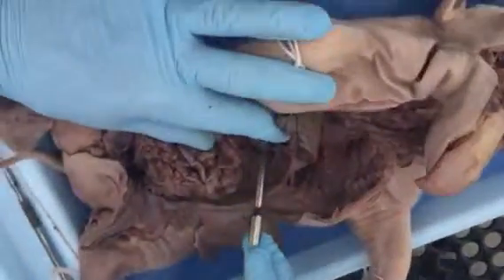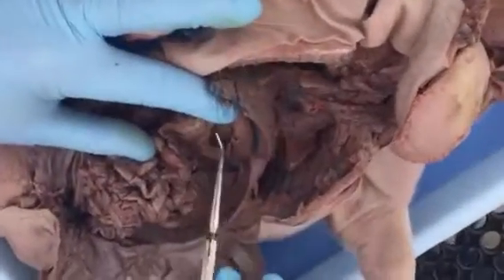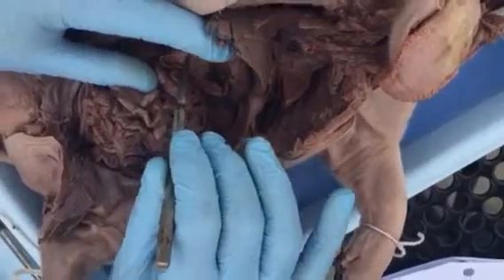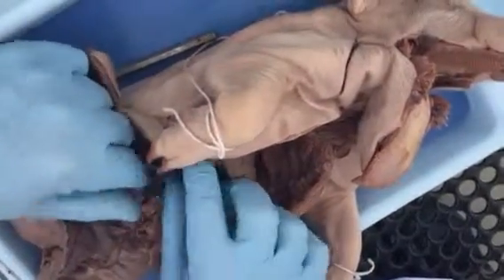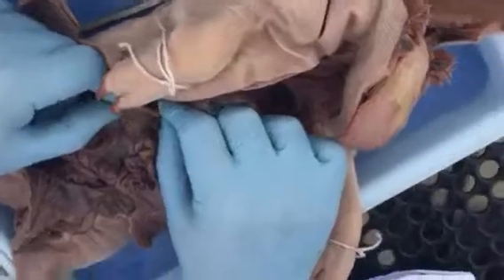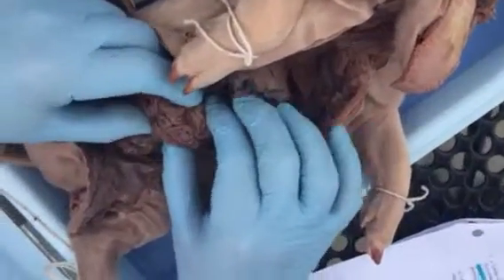Okay, at the other end of the stomach that leads into the small intestine, this is the pyloric region. You see this puckering here? That's the pyloric sphincter. Okay, small intestine has 3 regions. Okay, what I'm holding right now is the duodenum. For all intents and purposes, this is jejunum.